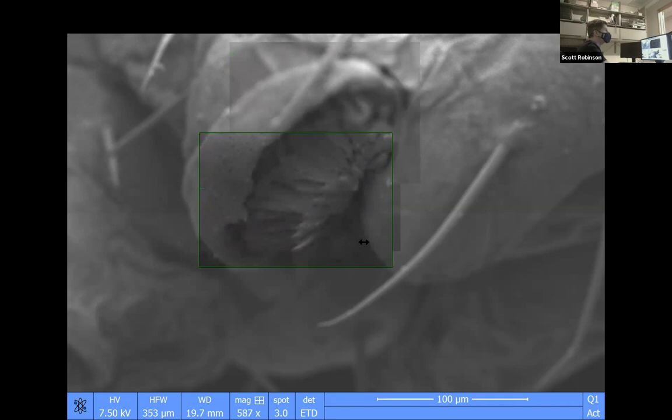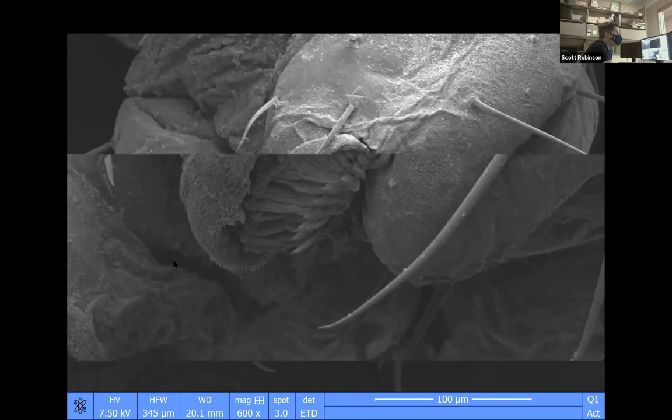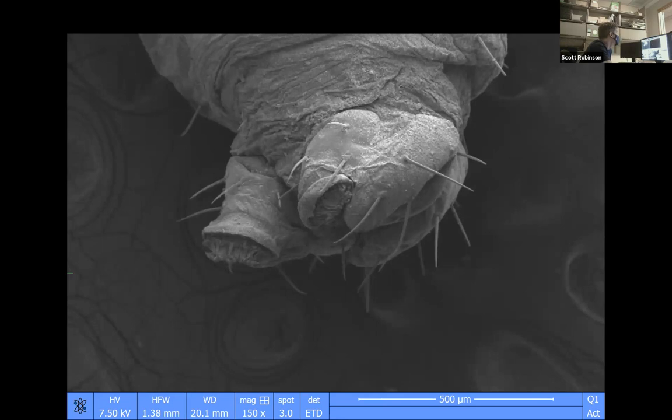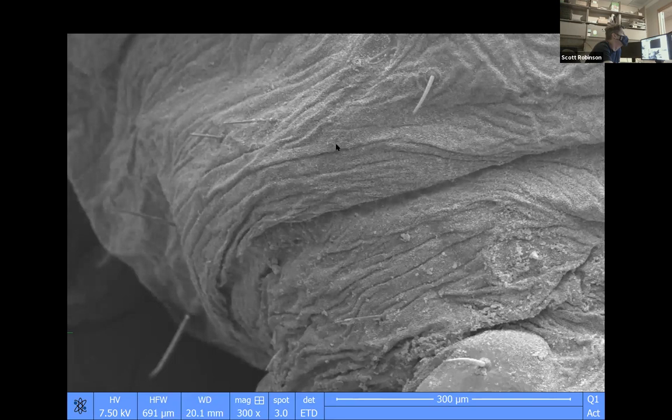So this is part of its tail. I don't know what that is. It looks actually like these are something that will allow it to grasp. Yeah, I think that has a specific name, but I forget what it is. It's got another pair of prolegs that are just on the very last segment, and they're a little bit chunkier than the other prolegs. Yeah. I think the crochet part is bigger. It probably has a specific name, but I don't remember it off the top of my head.